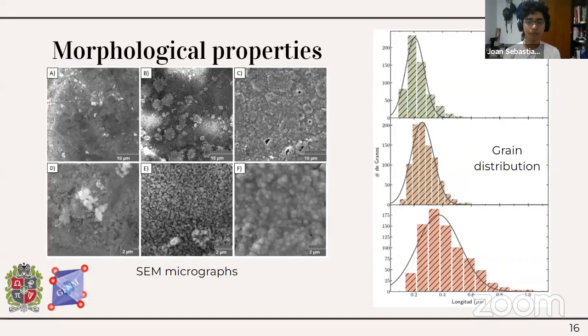In particular, it is worth mentioning that in the first sintering, the grains of what seemed to be the majority phase were sometimes too small to distinguish. That is, you can see some white dots that are not entirely well defined. After the second sintering, those white dots began to grow to form the nucleation process that we expected from the solid-state reaction. And after the last sintering process, in which we jumped from 900 degrees Celsius up to 1100 degrees Celsius, we found that basically we had a majority phase. The color was very homogeneous, and so we thought that we had completed our process.